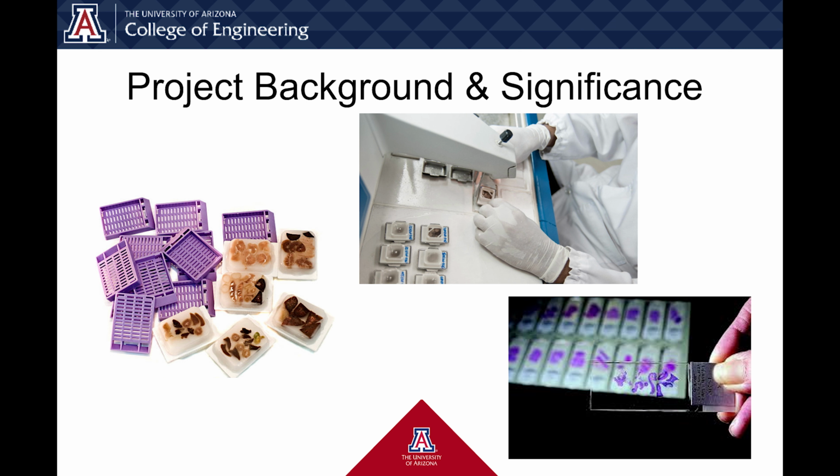This is why we bring the Histohelix, a histopath tissue block sorting module, which transforms the traditional process, automating the sorting and orientation of tissue blocks with precision and speed. Quicker turnaround times, enhanced accuracy, less stress for the staff, and most importantly, faster answers for patients. The Histohelix isn't just a leap forward in lab technology, it's a leap forward in patient care. And we're here to show you how we're setting new standards in histopathology to innovate, improve, and impact.